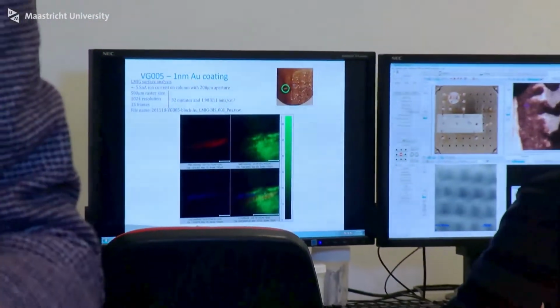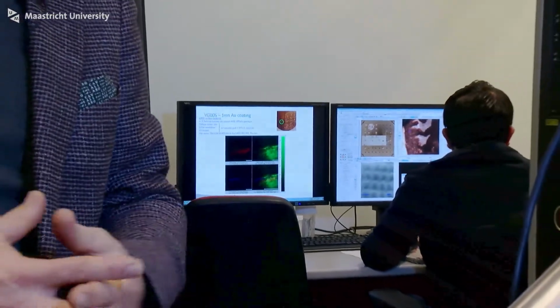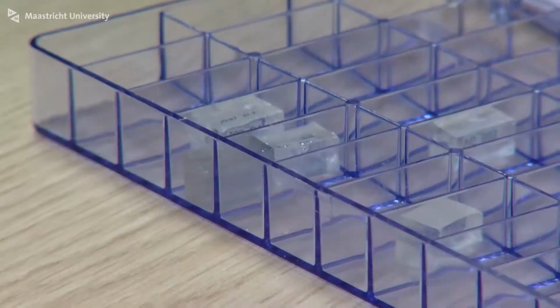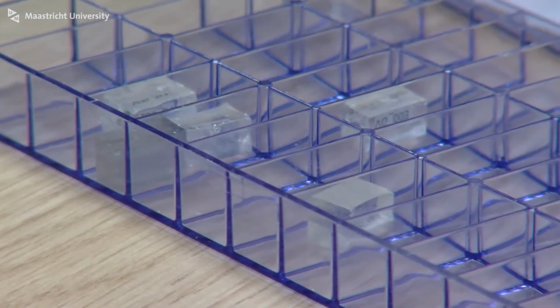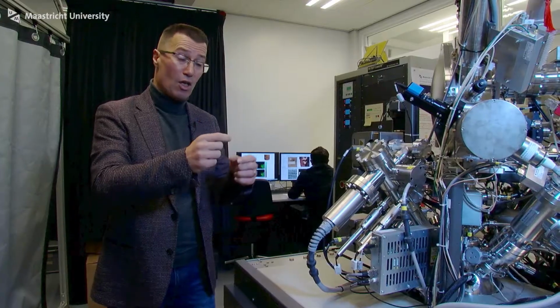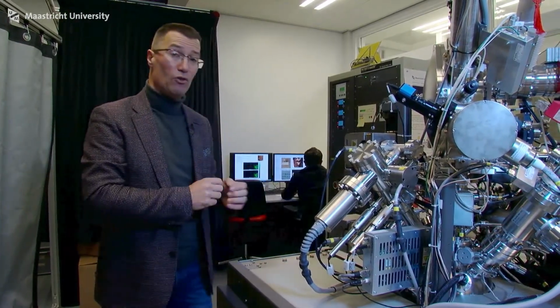So, in the beginning of this guided tour, I was telling you guys about the work we're doing on paint cross-section analysis. Well, this actually happens here at this high-resolution ion microscope. When these paint cross-sections are embedded, the resin is hardened, they're polished, and we can see under the microscope every layer. We actually put it here, mount it into this dome.